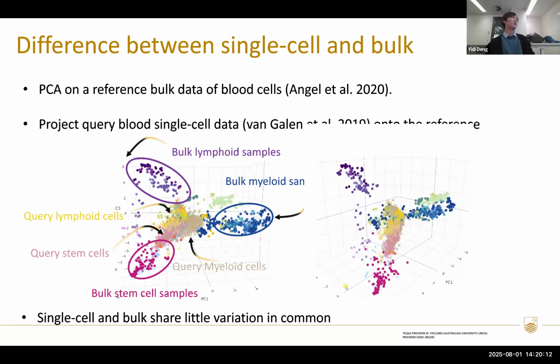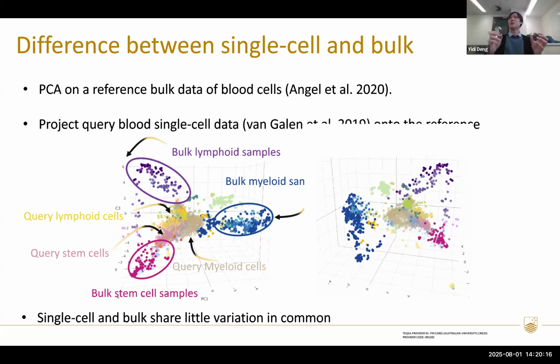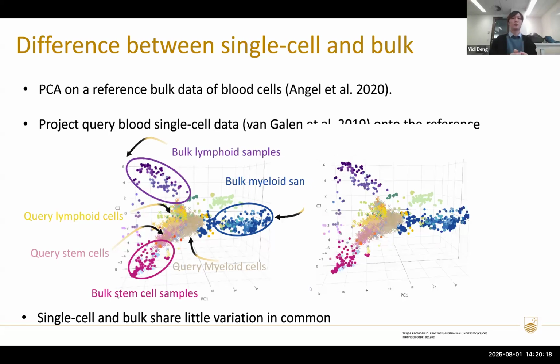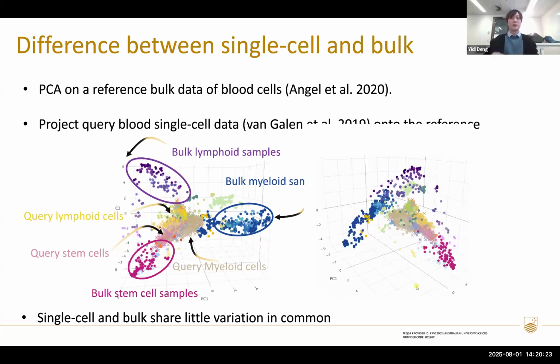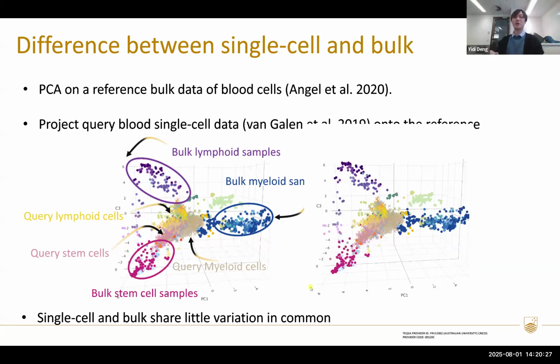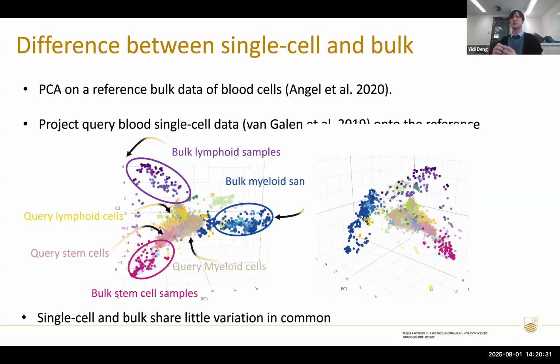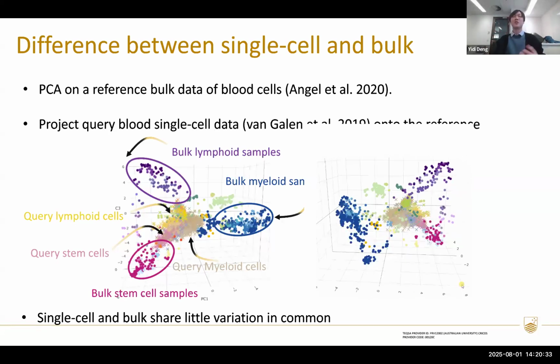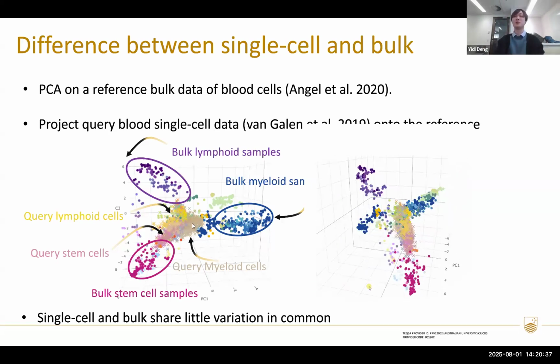You see, their cell types align in the same direction, but still they underfit the reference. This observation suggests that the 2 data sets share biological variation in common, but share very little in terms of technical differences. So you can imagine if you use annotation methods such as SingleR to do this kind of annotation, how wrong it could be.